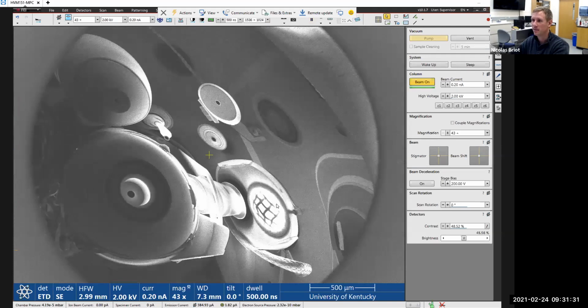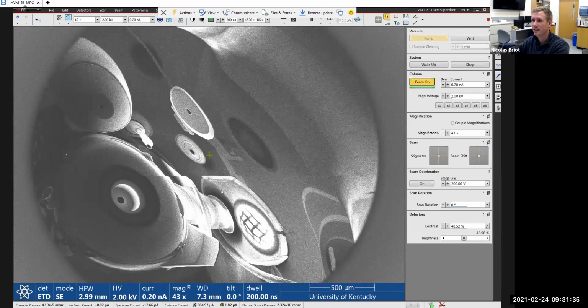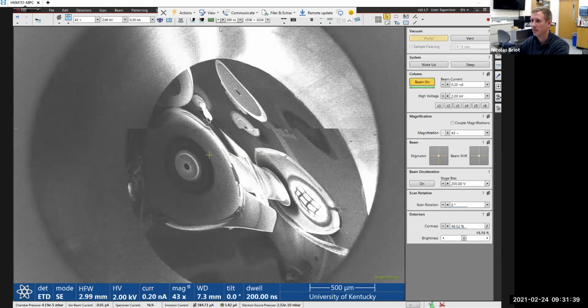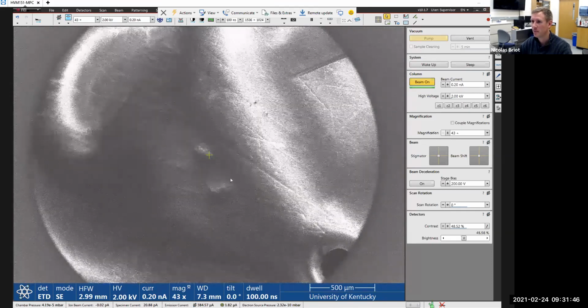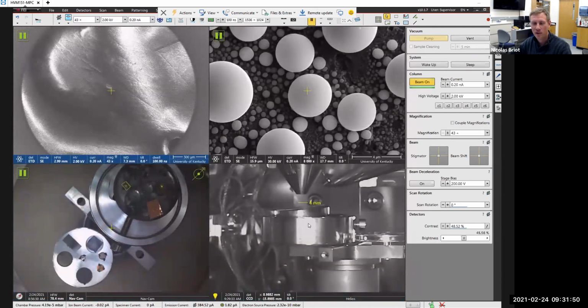If I zoom out, you can see, let's see, I think it's slowly closing on itself. All right, ready? Hop, the mirror has disappeared. And now we see the sample. So, of course, our goal is not to make mirrors, right? We want to image our samples, even when they are not electrically conductive. So we have tricks, and I'll talk about them in a second.